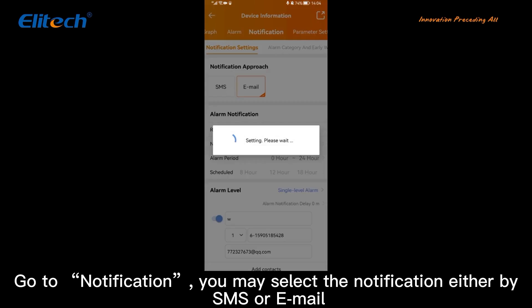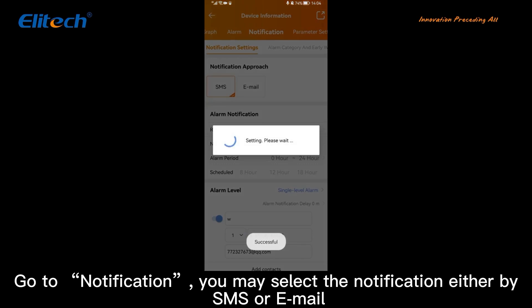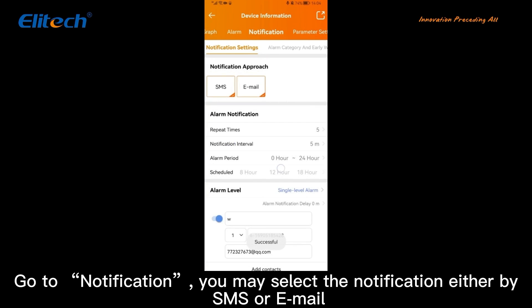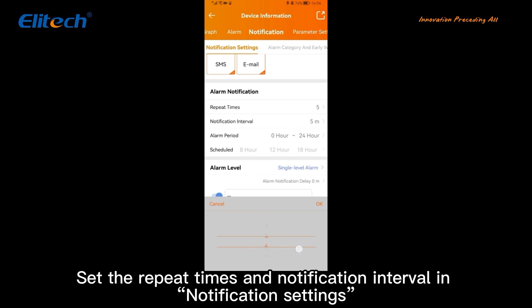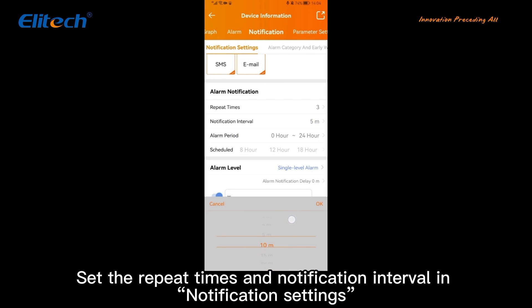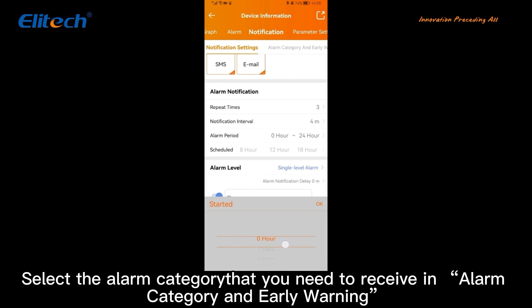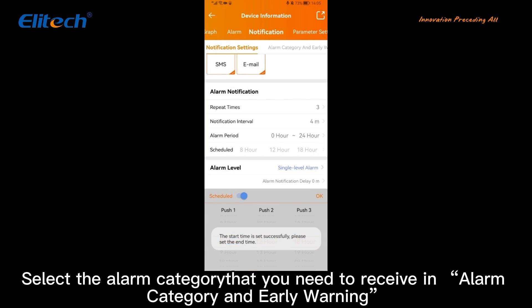Go to Notification — you may select the notification method either by SMS or email. Set the repeat times and notification interval in the notification settings. Select the alarm category that you need to receive in Alarm Category and Early Warning.